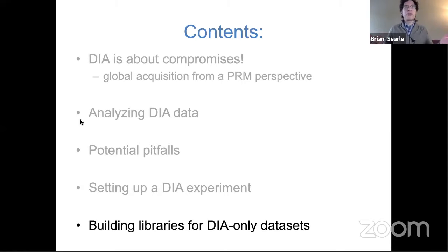where there's the peptide that you're interested in and all other possible peptides, because every other peptide has that same fragment ion. And so it's necessary to make sure that your decoys have that same characteristic, because if you actually removed, for example, Y1, then it's trivial to tell whether a peptide is a decoy or not, because it won't have that same Y1 signature. So that's one of the reasons why it's really important to keep the same kind of characteristics of the termini. Again, the same thing happens with B1 too.